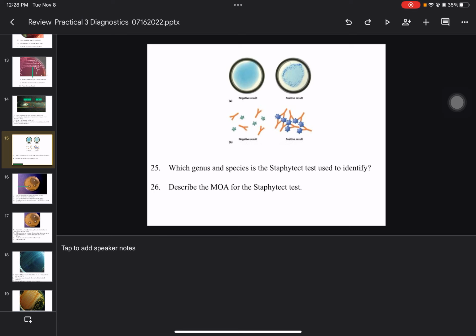I think I was calling this the coagulase test. It's not. The coagulase test uses rabbit plasma, and it clots it. It's a different enzyme. So do we not have to know that? There will be no coagulase. We didn't talk about it. I actually said, hey guys, listen up, some of my colleagues at other campuses still use coagulase tests.